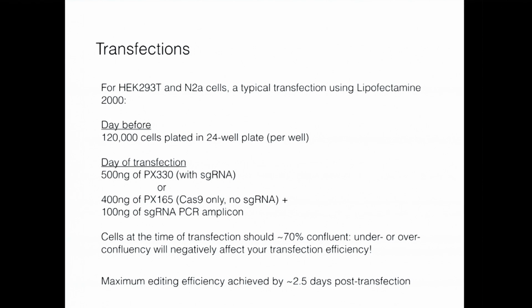We've done time course experiments to see how fast the editing happens. And usually, at least in HEK cells, after about 2.5 days, the editing reaches saturation. And I can harvest or clonally expand the cells anytime after that.